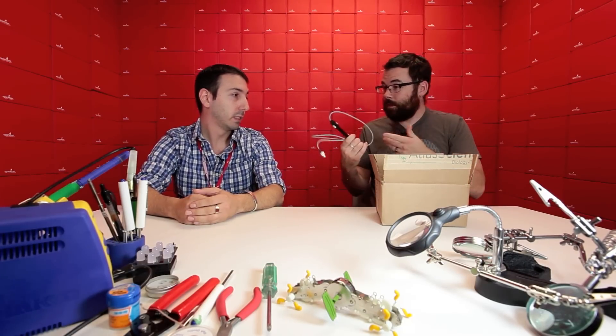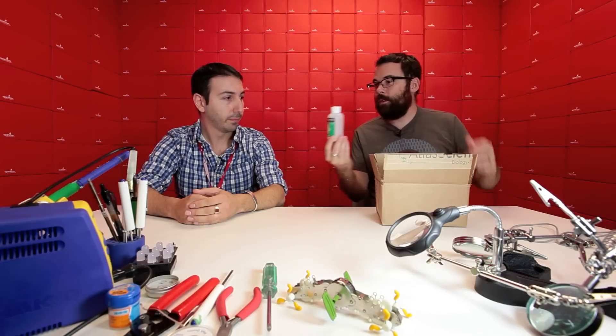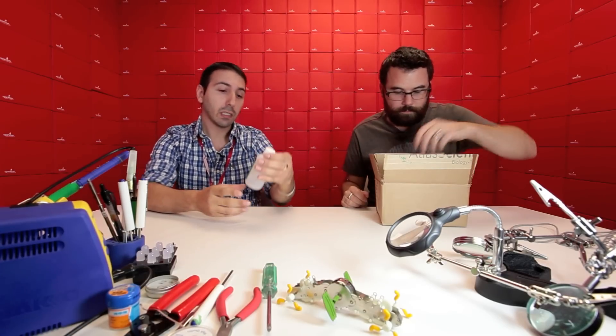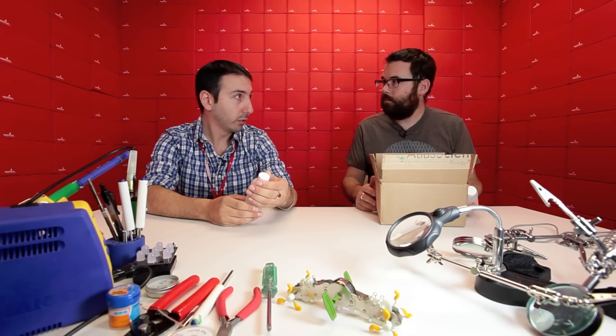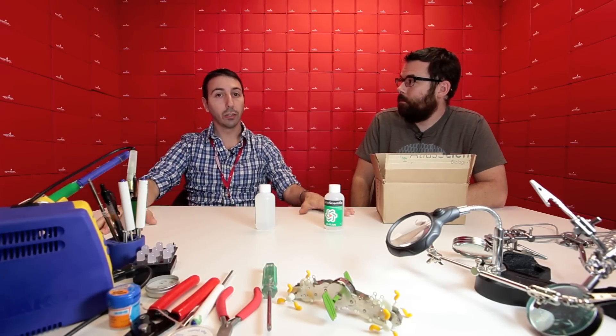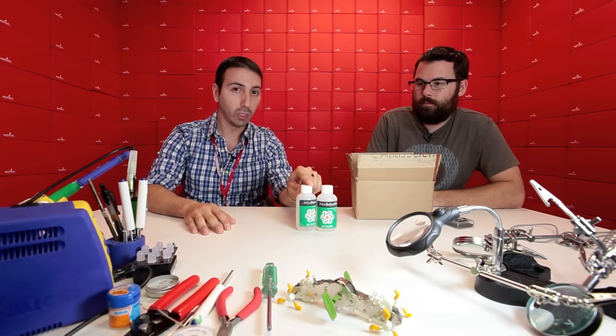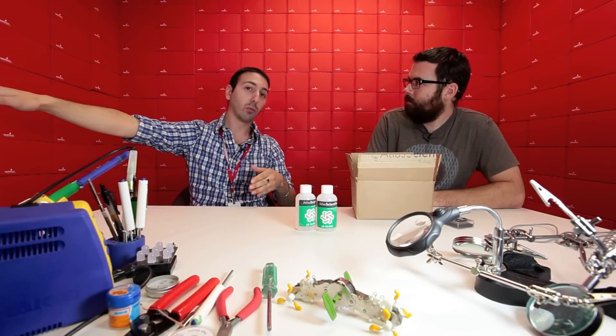So we've got this guy which is the probe, right, and then we've got these guys. Tell me what these are. Now these are calibration solutions. You need calibration solutions to give the sensor some points to understand where it is in the world. You just put the probe in, tell it what it's in, and then boom, it has a reference point.